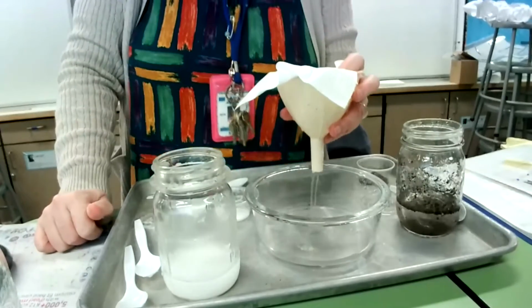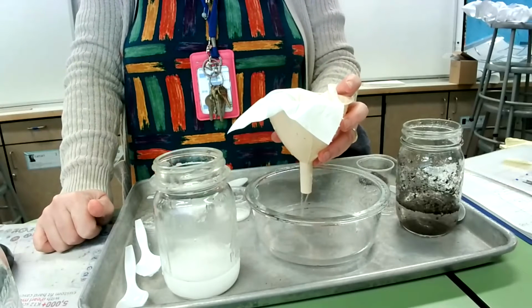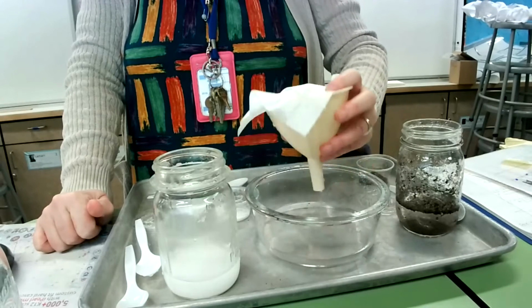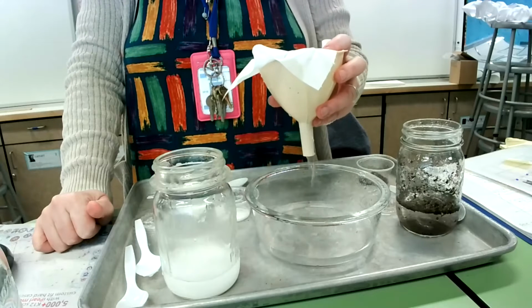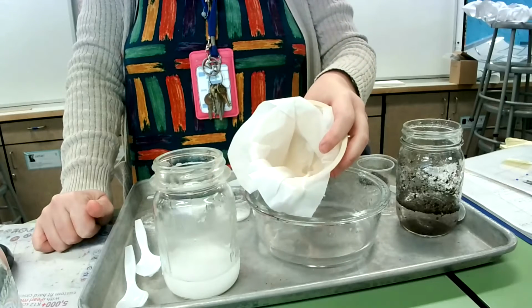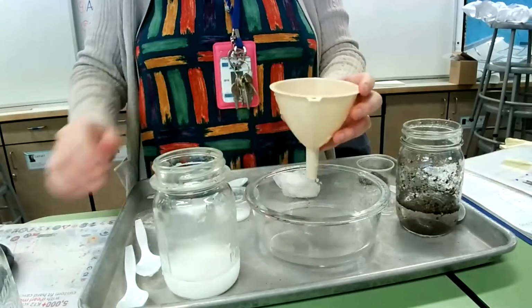Okay, and I have a clear liquid on the top, and it's a completely clear liquid that's going through the bottom. And you can see there's nothing left on the filter. There's no discoloration. All of the water is going through and nothing is left on my filter. Nothing's left on it. Okay, so the sugar in the water was definitely dissolved.